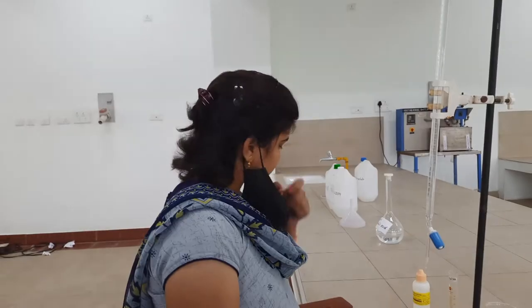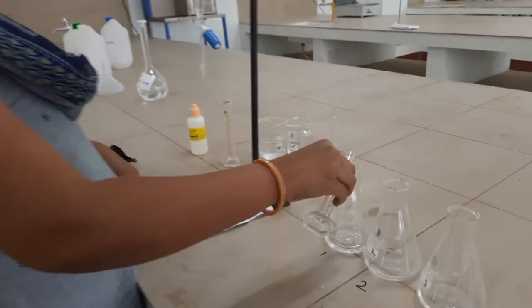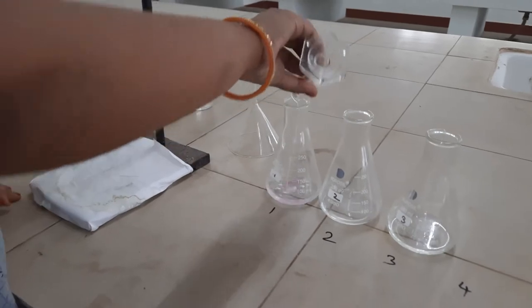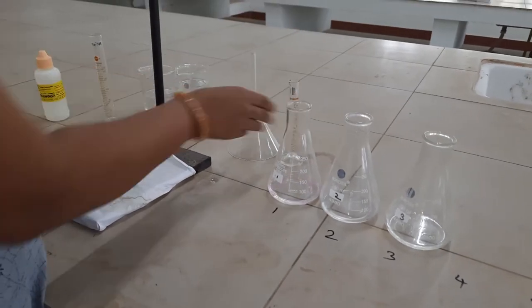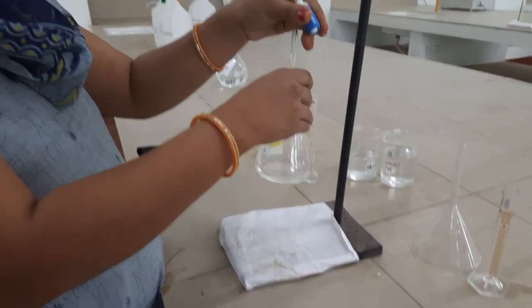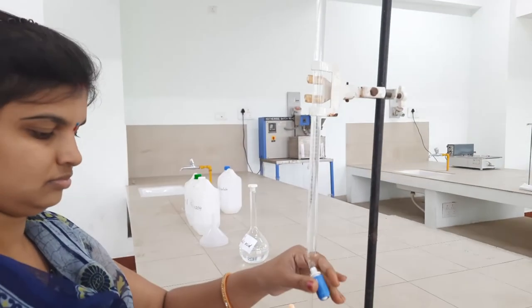Ready, 3, 2, 1. So we have collected 10 ml sample from the plug flow reactor after the steady state is attained at a particular RPM of 60 RPM. Now we are titrating it against 0.05 normal NaOH.